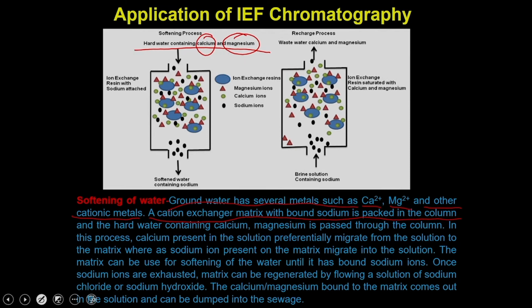As a result, the water that comes out is devoid of calcium and magnesium.